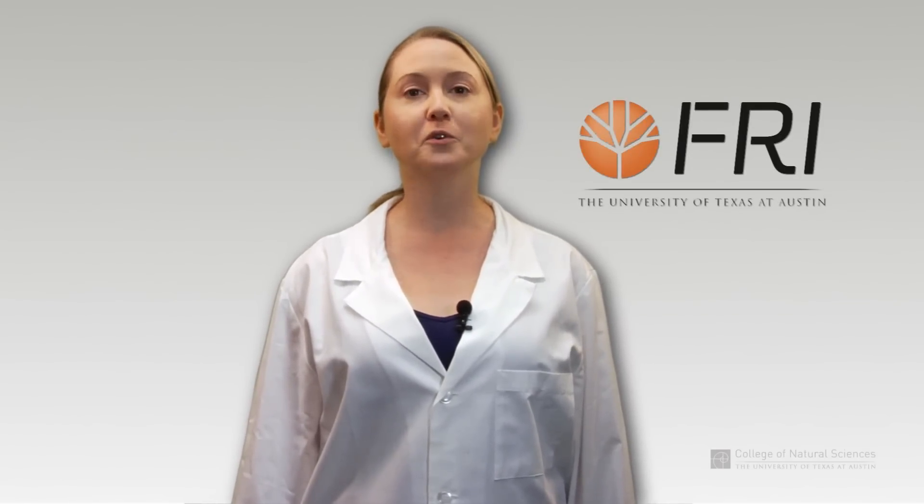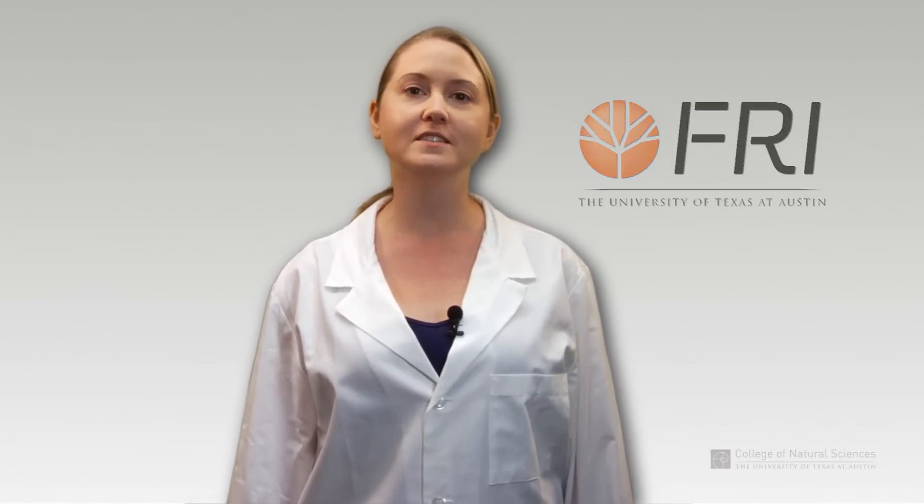Fume hoods are vented cabinets that protect the user from hazardous powders, vapors, and gases. When used properly, the fume hood not only provides respiratory protection for the user, but can shield the user in the event of an emergency situation such as a fire, explosion, or spill.